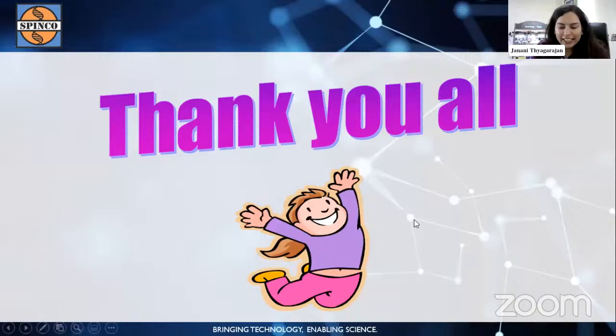Thank you, sir, for the very incisive masterclass on mass spectrometry. Starting this tour with the sample nature, the basic criteria that has to be met for ionization, the different ionization techniques in LC, GC, and its effects and processes, and of course, the MALDI for all the large molecules like proteins. You have just taken us through a suite of all the mass spec options that are available today. But it looks like a single session is not enough to cover the entire basics of mass spectrometry. So, do we have another session? Like a part 2 on an MS tool?